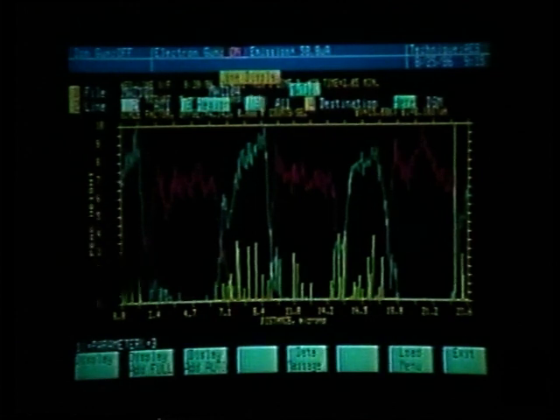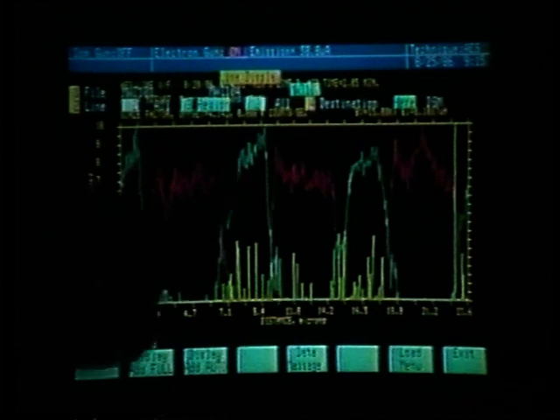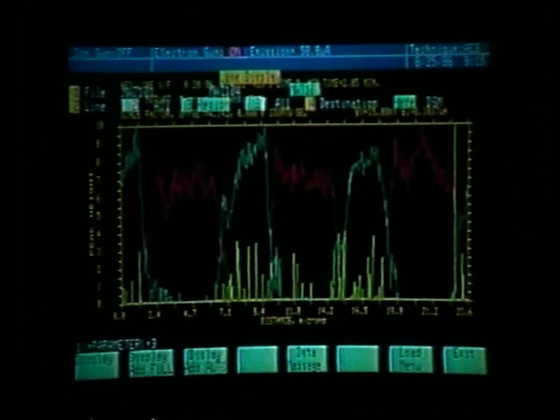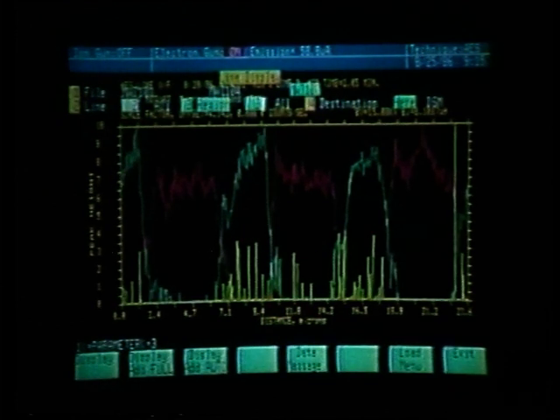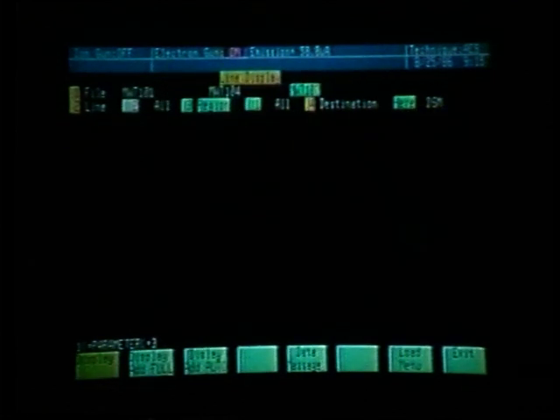And we see that what we want to display is the gold and the silicon peaks, but not use the tantalum. Let's once again then display region number 1. We want to use the display soft key number 1, so it will erase what has already been displayed.